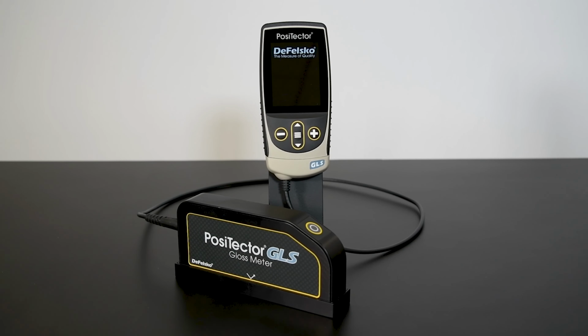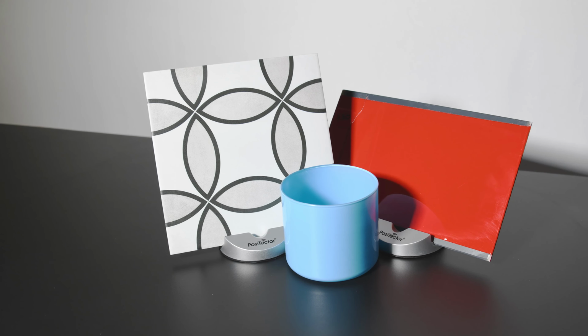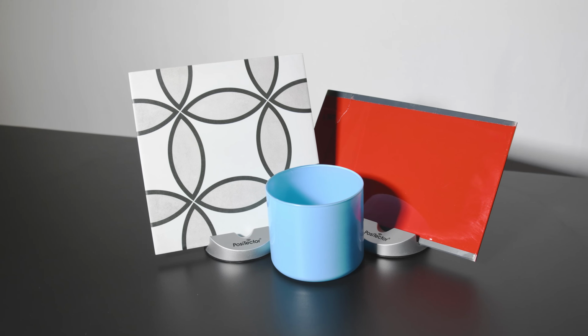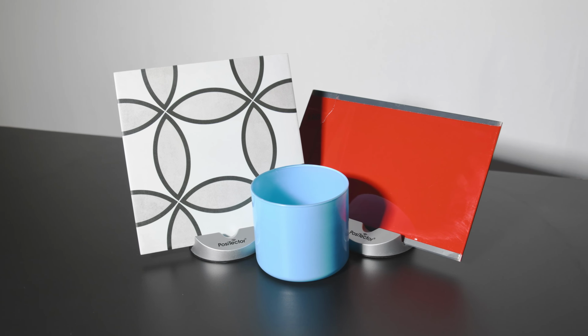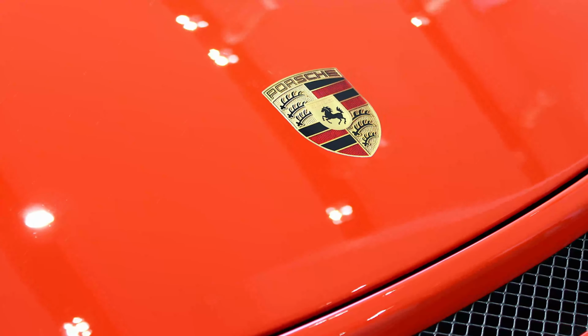How to measure gloss using the PosiTector GLS Glanzmessgerät from DeFelsko, the measure of quality. Gloss is an optical property that indicates how well a surface reflects light in a specular, mirror-like direction. It refers to how lustrous or shiny an object appears, generally affecting its aesthetic and perceived value.